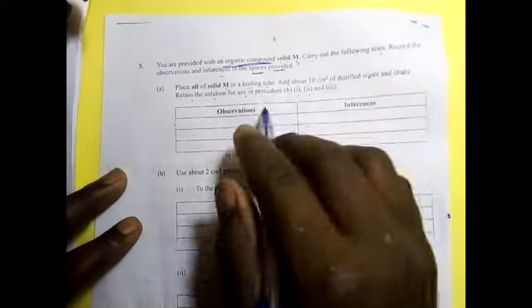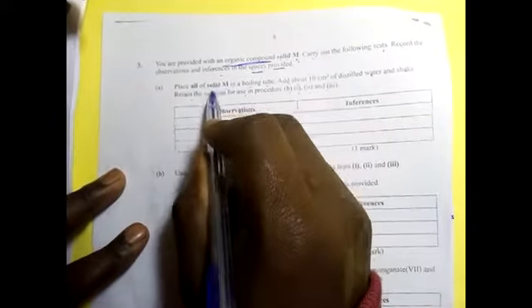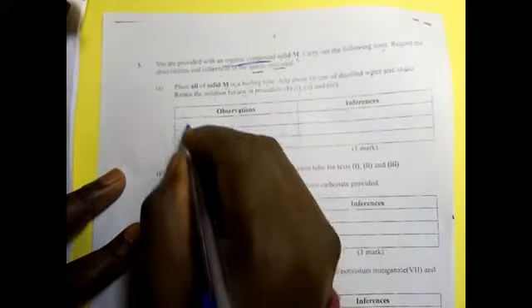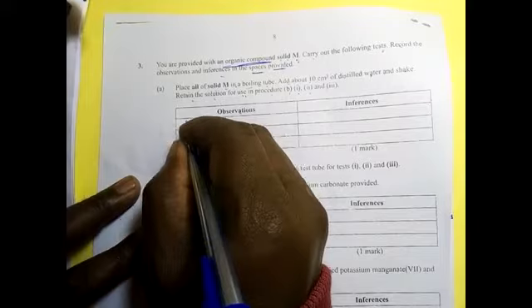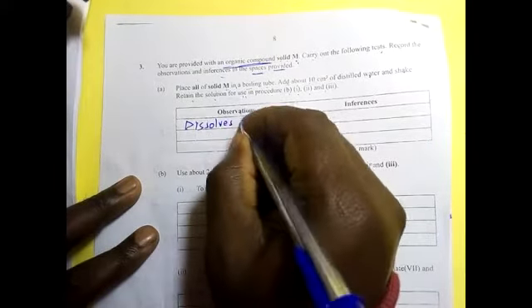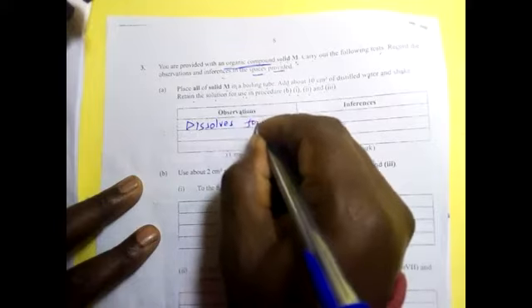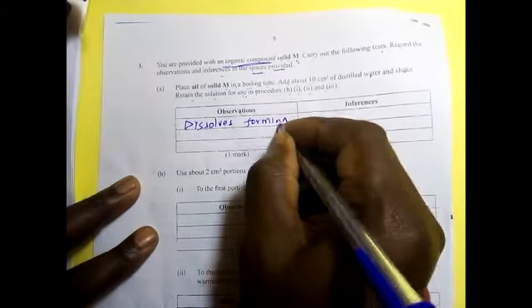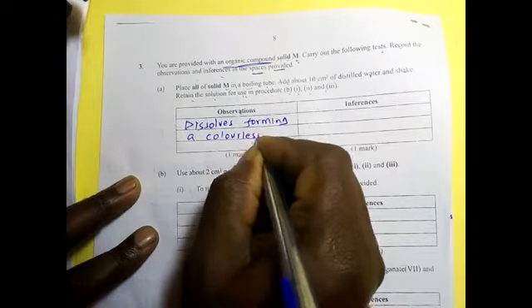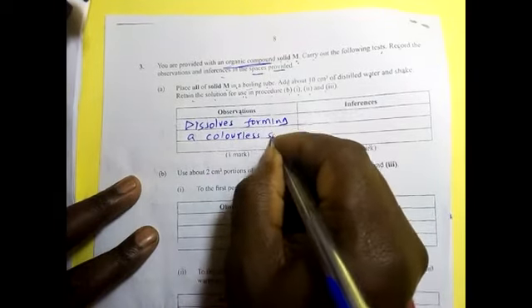So, here we want to state the observation. Did the solid M dissolve in water? Yes or no? So, the solid dissolves, forming a colorless solution.